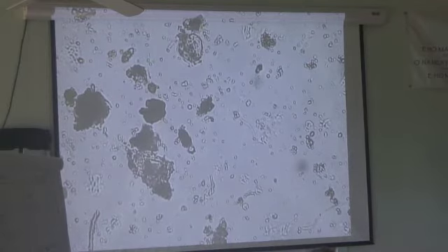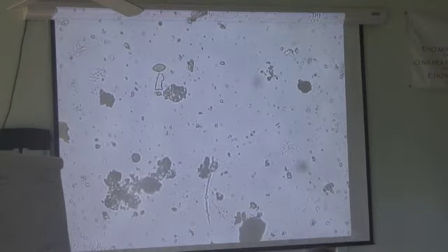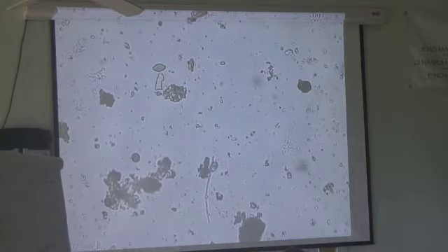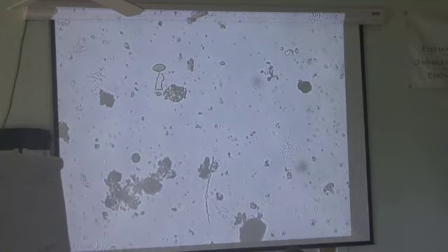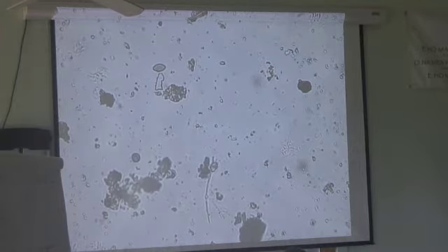So that was field three, so let's go on to field four. Just continue. You're just moving down each time. Yep, I'm just moving down. I will do five fields here on my cover slip, and then I'll move over, do five fields up, move over, do five fields down, move over, do five fields up, if I feel the need to do that many fields.